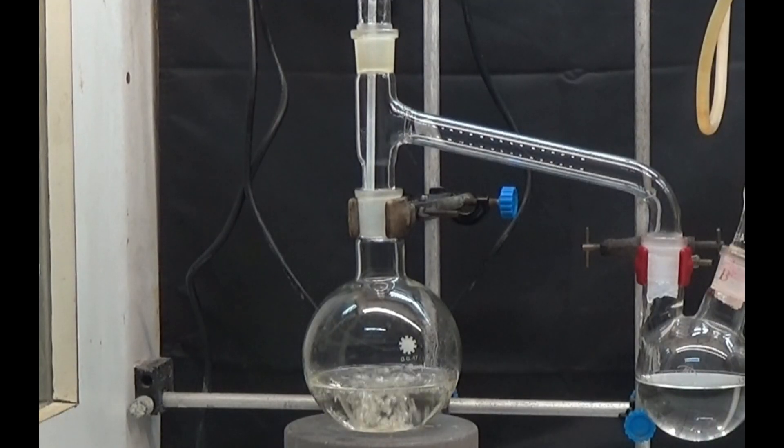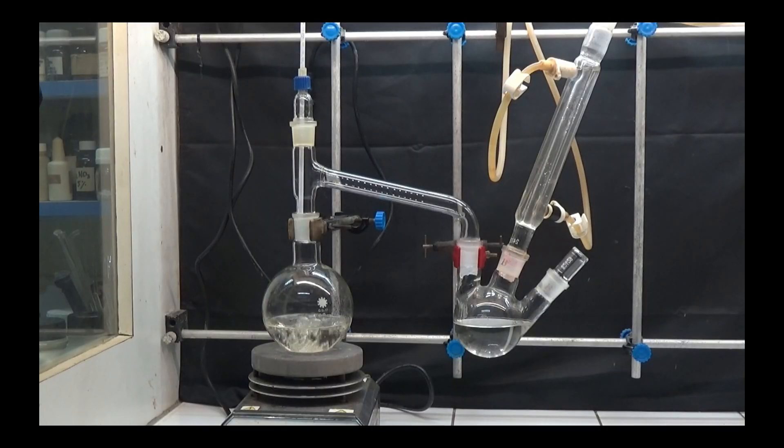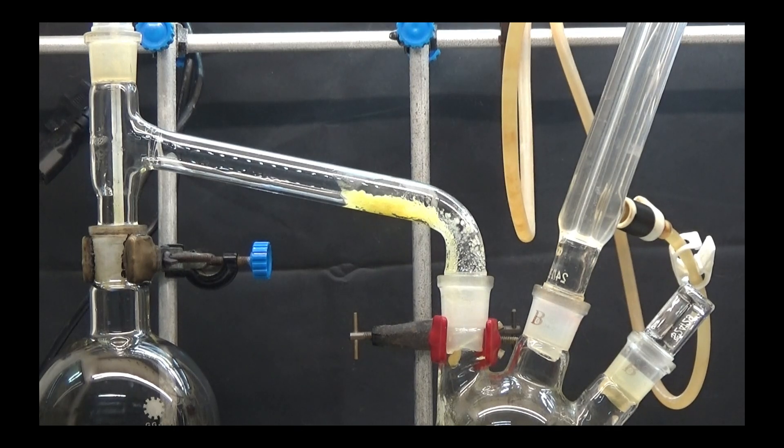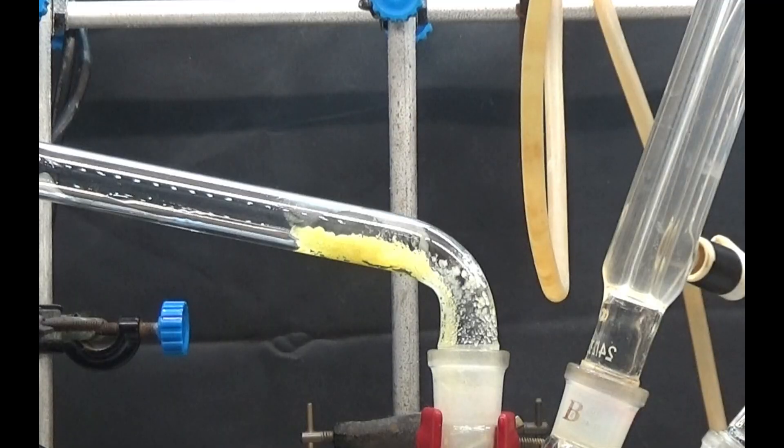Assemble a 500ml flask with a distillation head. Connect the outlet tube to another 250ml three-necked flask. The tube must be 20mm and not smaller. Succinamide can solidify in the tube and obstruct the distillation.